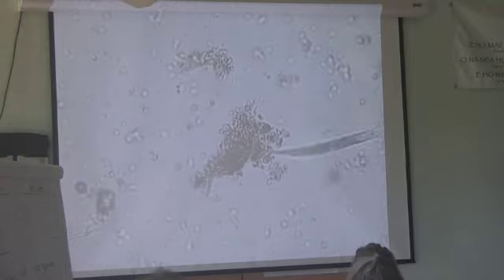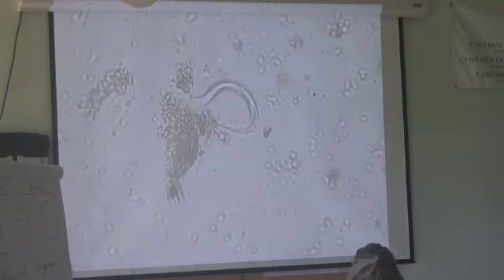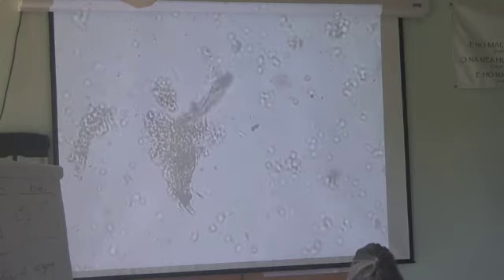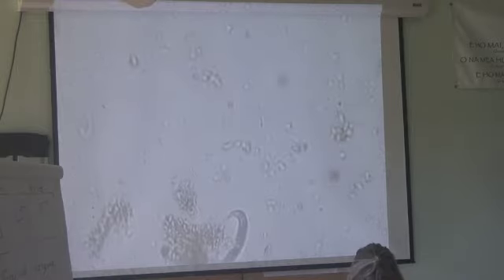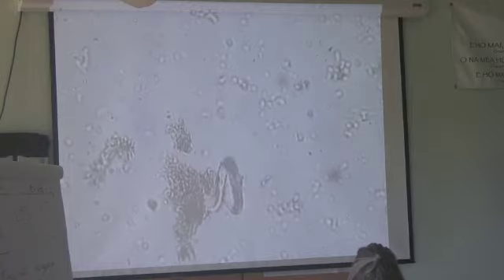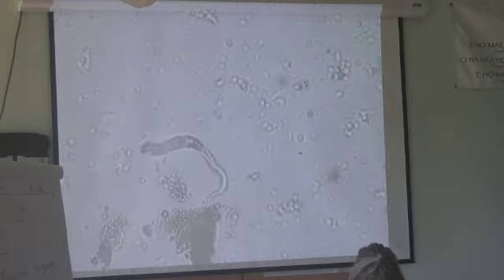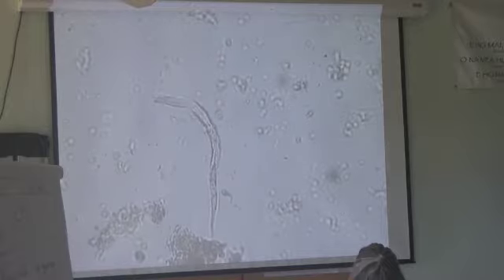Let me go. I'll eat you. So, bacterial feeder. I don't see anything. So in that end of his body moves out, you can. So there's not anything other than just kind of a straight stoma at that end. Again, we could come back and keep the slide and really look at what's in his mouth part later on.